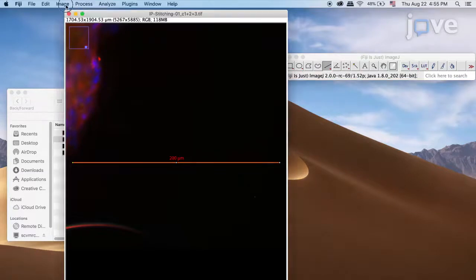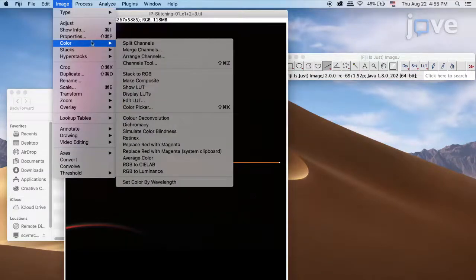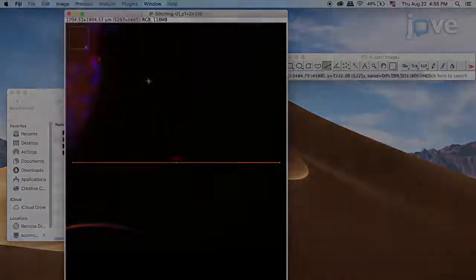Next, select Image, Color, Make Composite to create a composite image of all channels.